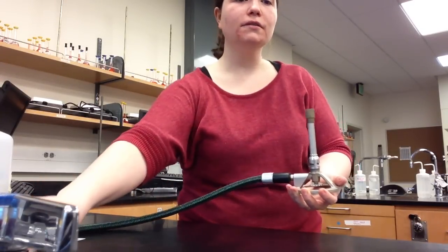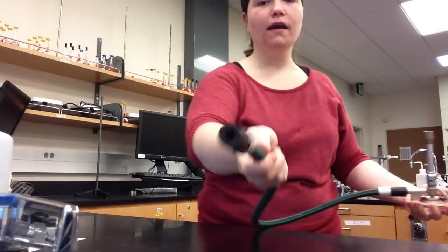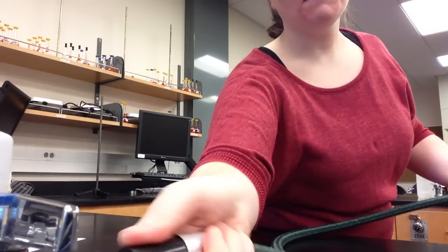Attached to the Bunsen burner is a long hose. One end goes on the Bunsen burner and the other on the blue gas valve in the middle of your lab bench.